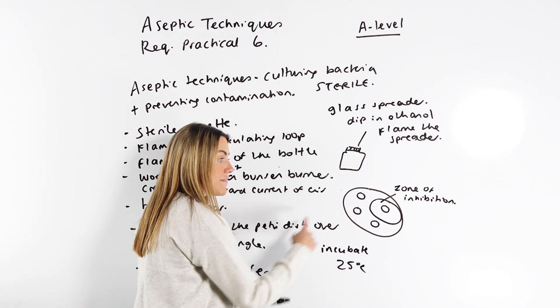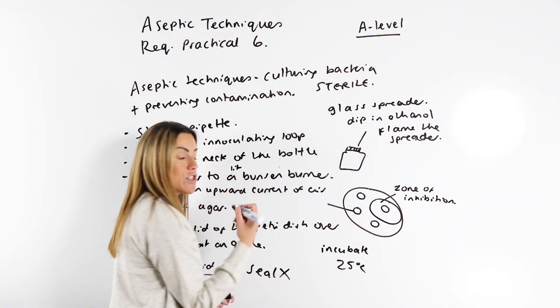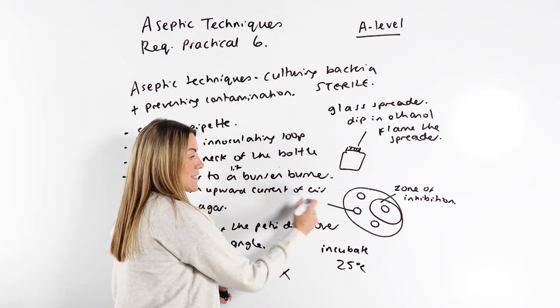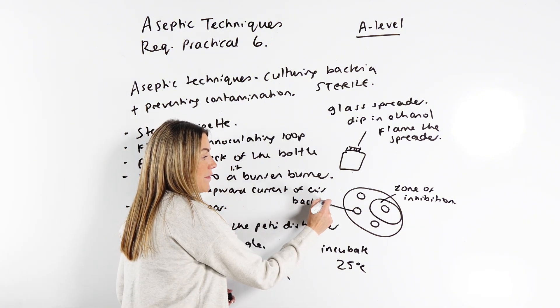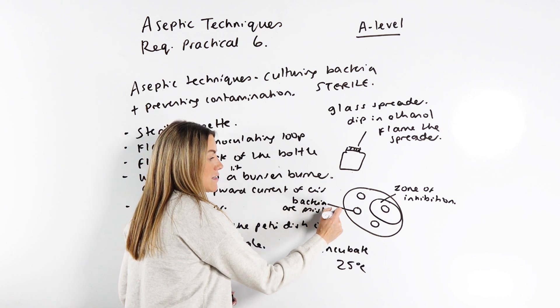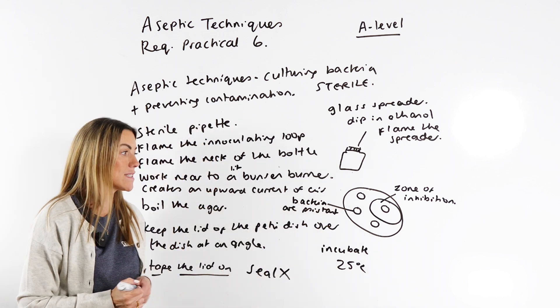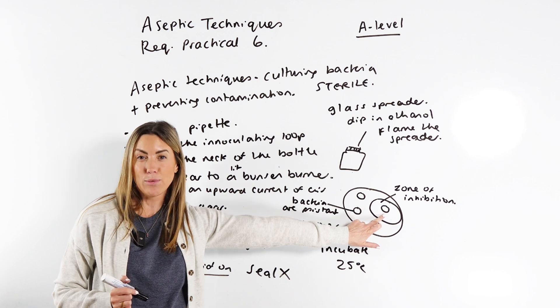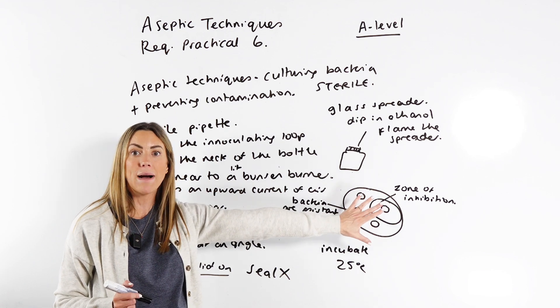If you don't see a zone of inhibition, like here, there's no zone of inhibition. That's telling you that the bacteria are resistant to that particular antibiotic, whereas obviously, they're susceptible to this one because they were killed by it.